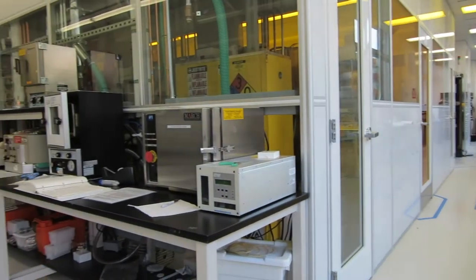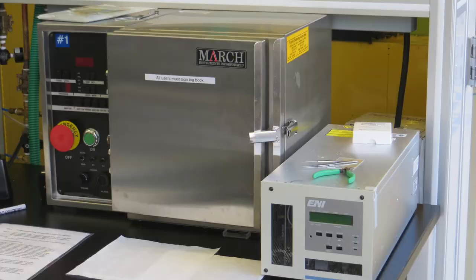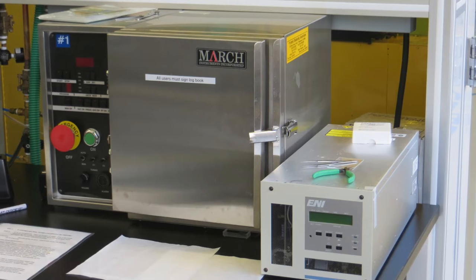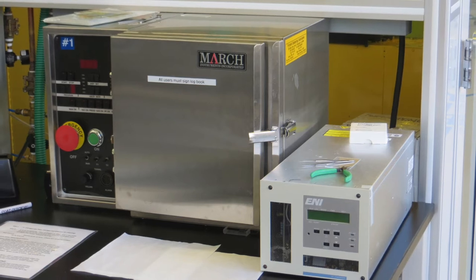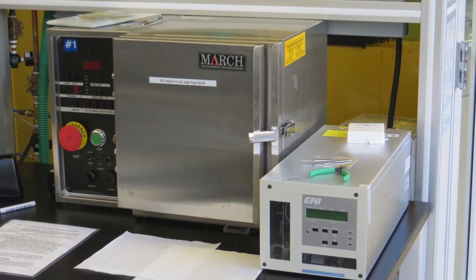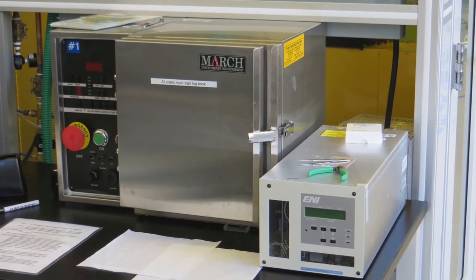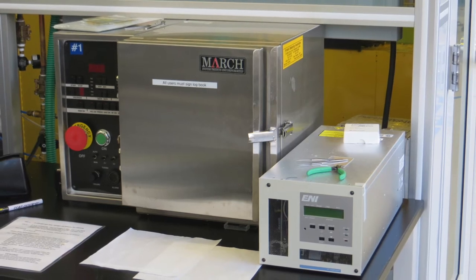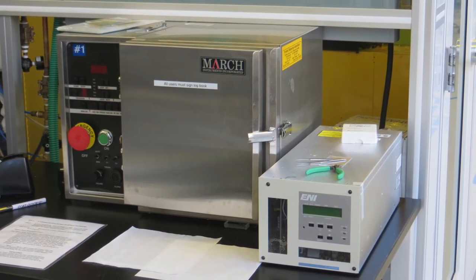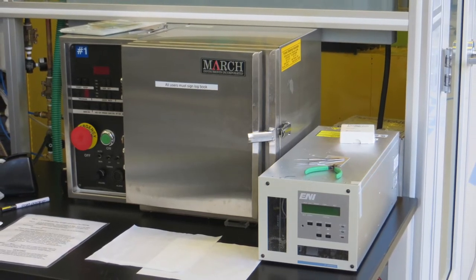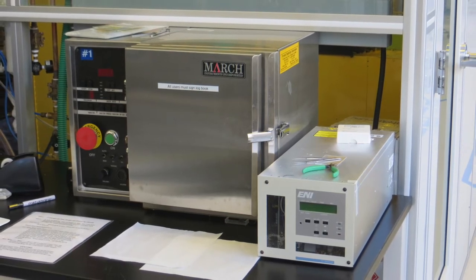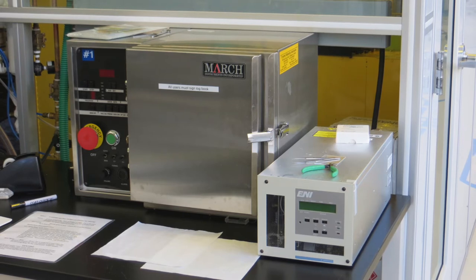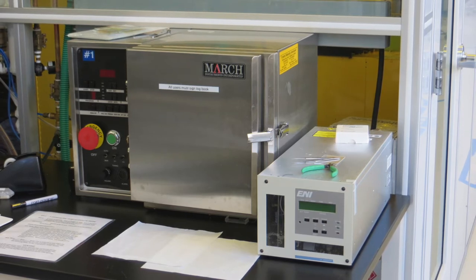In this same room across from the microscopes is the plasma Asher. The plasma Asher uses an oxygen plasma to clean off organic residues and dry etch organic films. Many of our users also use it for chemically modifying the surface of PDMS or other polymers to help with bonding operations. An oxygen plasma also increases the wettability of surfaces prior to spinning polymers or resists for better adhesion.